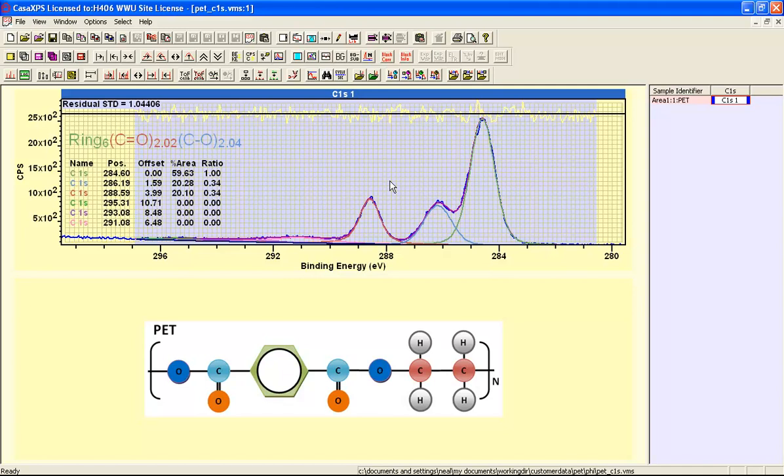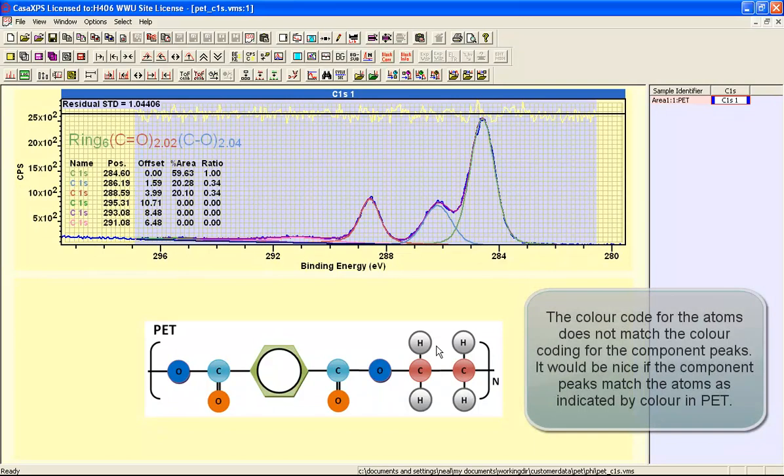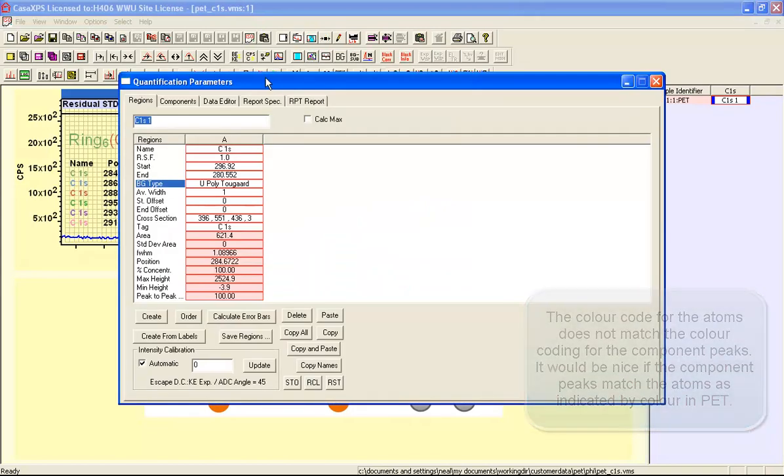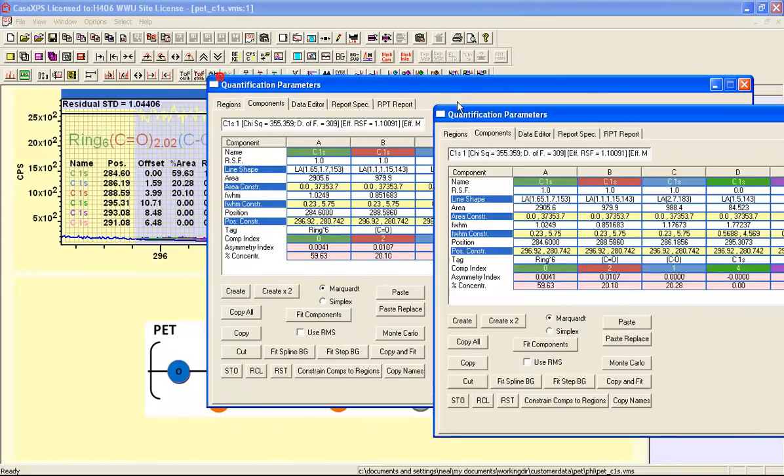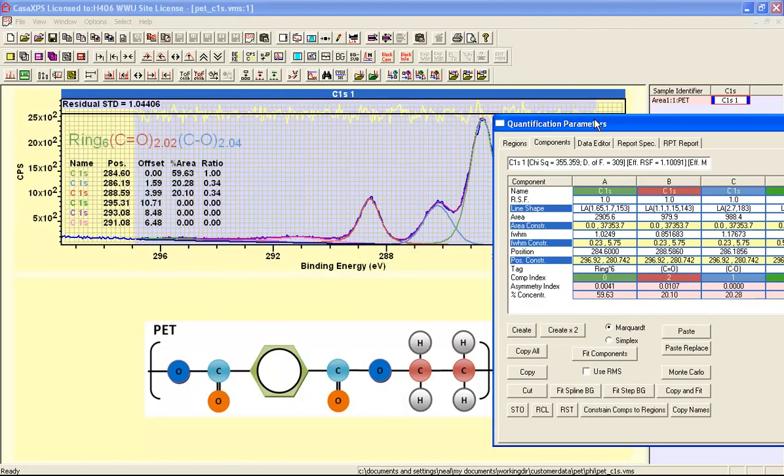The state of this peak model when compared to this polymer description is not right in terms of colors. I can alter this by bringing up the quantification parameters dialog window and at the moment these are being colored according to the position within the table. A, B, C etc. are determining the colors for this particular display.